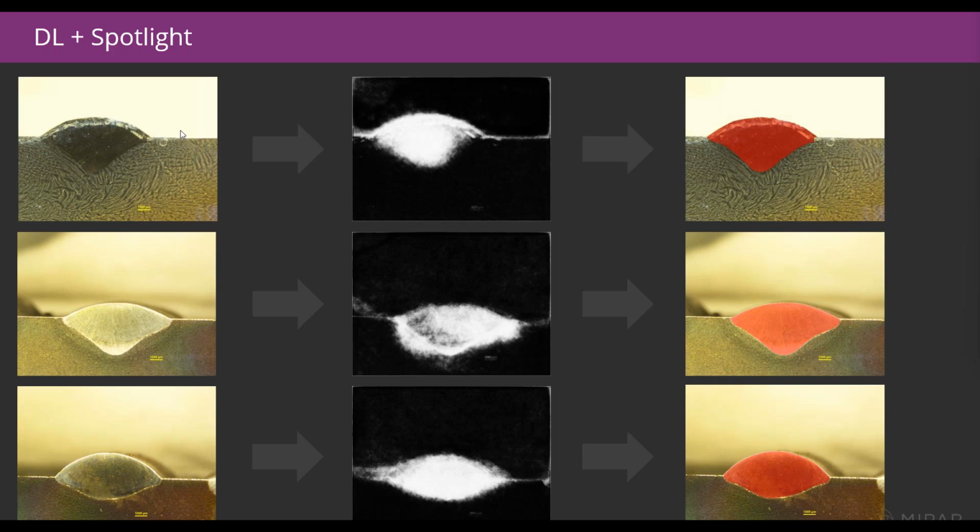Okay, thanks, John. We have two questions from the same individual, and I think we'll try and take them together as they are definitely related. Are you open for personal presentation to evaluate my system and to determine the benefits and to adapt it? And would you be able to teach the system to differentiate cracks over solidification within the weld?